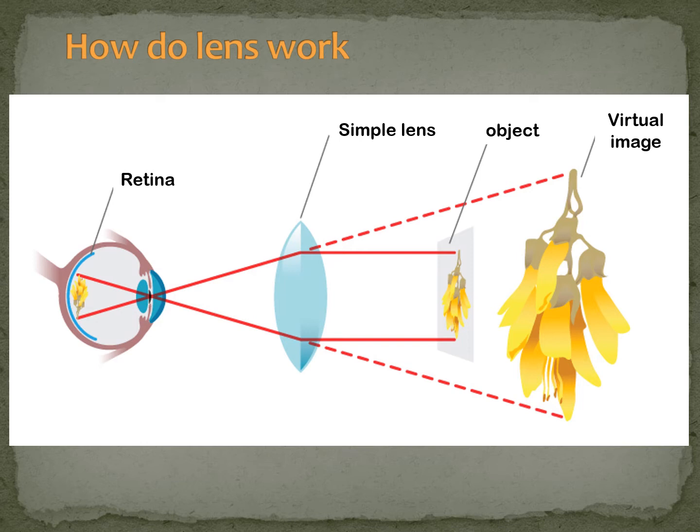So there was some degree of amplification of the image. This will depend, again, on the size of the lens and the distance between the lens and the object. But basically, this is the function of a lens, taking into consideration these properties of light I just mentioned.